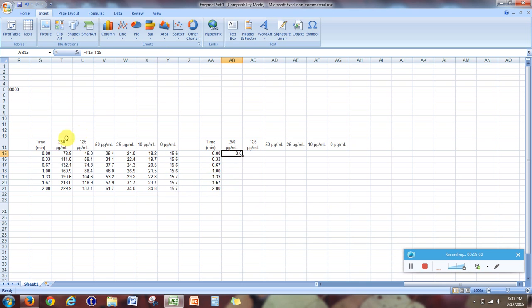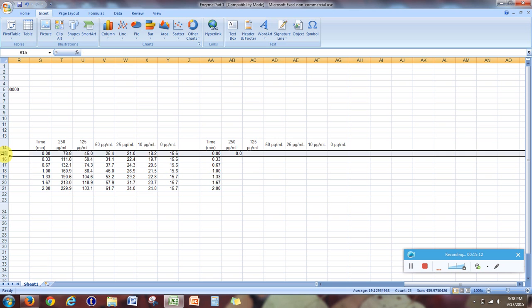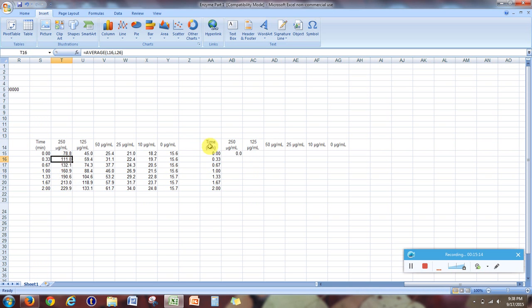Well, remember our dollar sign. What we want this to do is basically every single number underneath it needs to have this row subtracted. This row happens to be row 15 in my Excel right now. So in my formula over here, I can tell it to just subtract whatever happens to be in row 15.